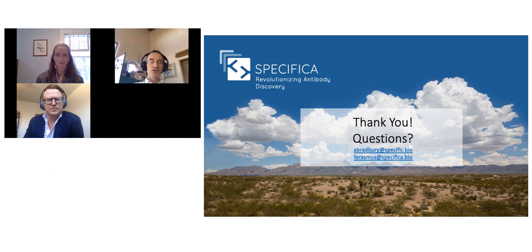So this allows us to take those sequenced CDRs, examine them for liabilities, and eliminate those that have liabilities. So this is purely an informatic thing. As I mentioned during the talk, we can't do that for HCDR3 because the diversity of the HCDR3s is so much greater.